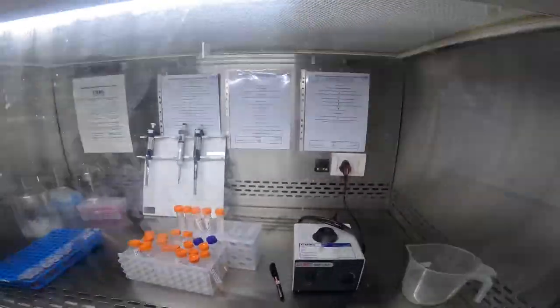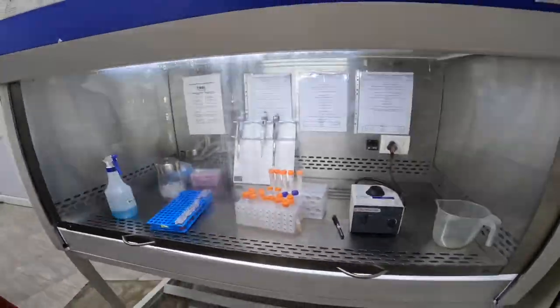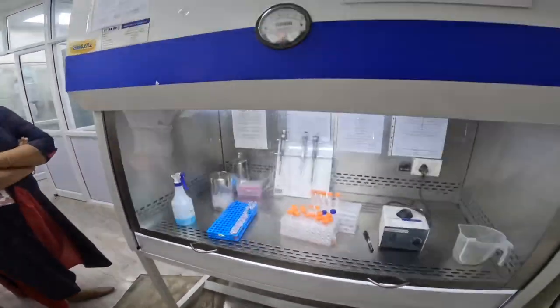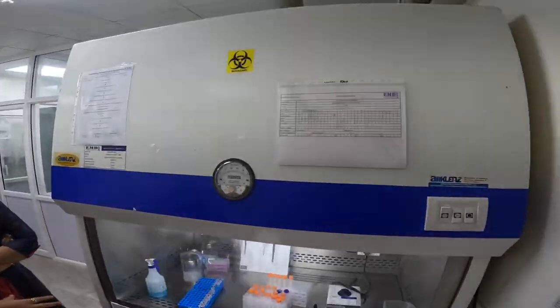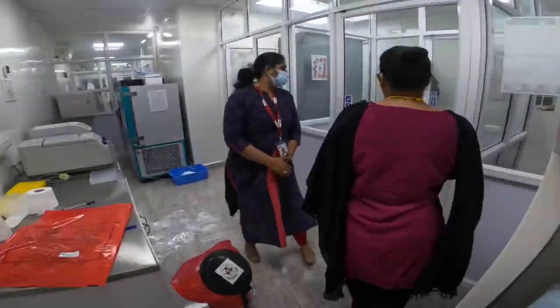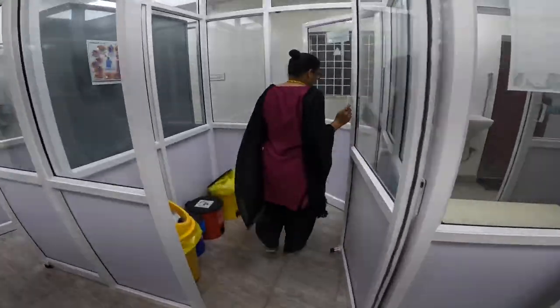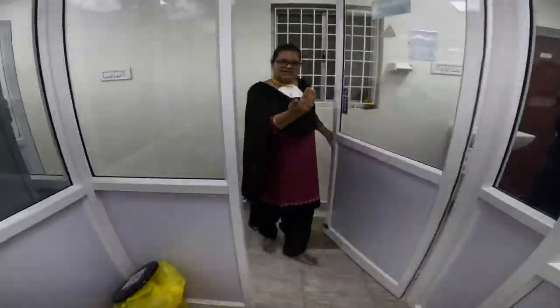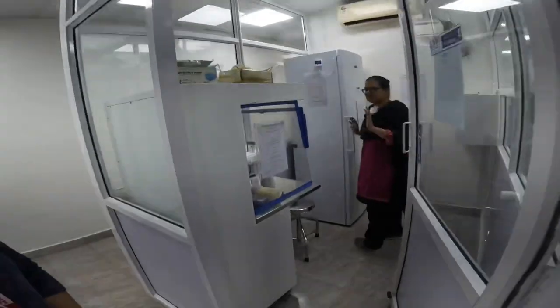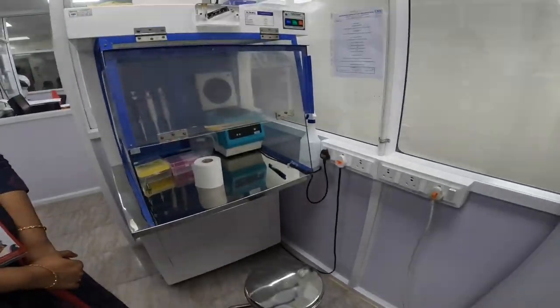This room is designed in such a way that the airflow is just unidirectional, so that no outside air comes in. When you are walking out of this room, you yourself will see how this unidirectional flow works. So now we are going to go out of this room. If you see here, we are opening this door, and this door cannot be opened both ways. It is just one way, so that the airflow is unidirectional and cross infection is prevented while preparing these aliquot solutions. Now we are coming to the next room.